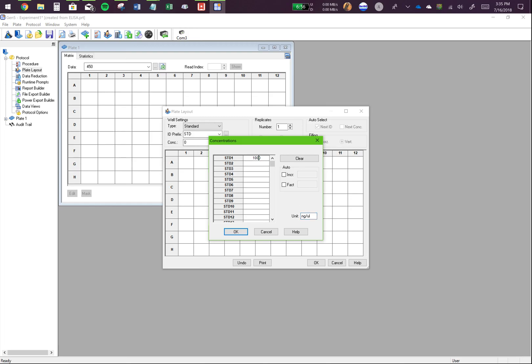And let's say I diluted all these serially in two-fold dilutions. So click on fact. Now the catch with this program is you don't write two if you're diluting it two-fold. You actually write 0.5. So select here. And as I click on the next standard, the values will automatically be put in.